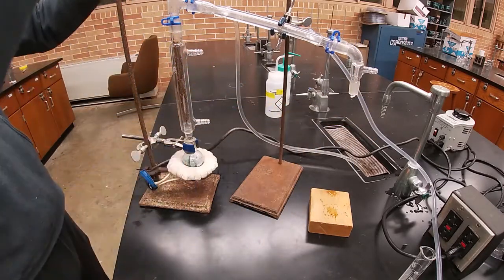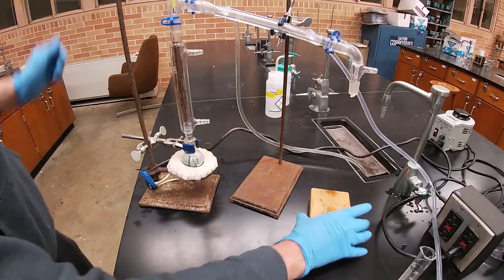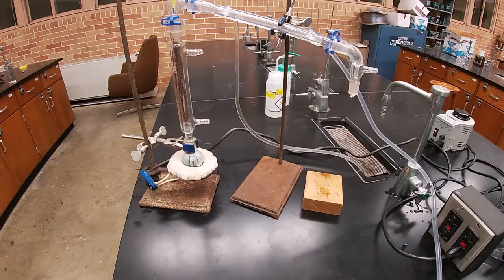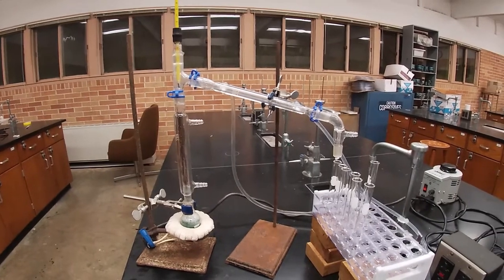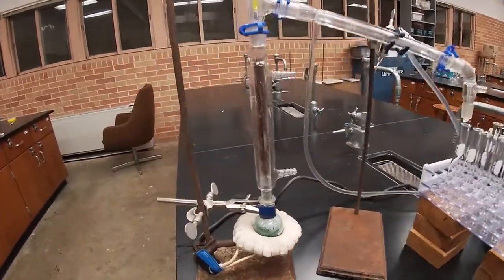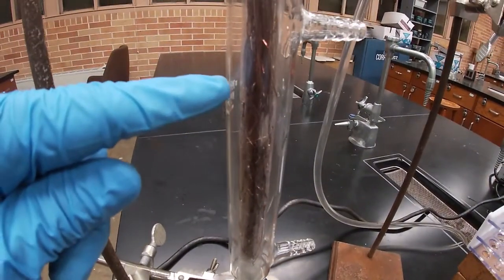All right, I'm going to put my thermometer adapter and thermometer back in. This is cooled down. Okay. And checking my water flow, we're still good. I believe we are ready now to start our fractional distillation. Okay, it's beginning to boil, and I wanted to show you the fractionating column. So it's boiling down here, and the vapors are beginning to rise up in the fractionating column. And in fact, the vapors are all the way up to here right now.